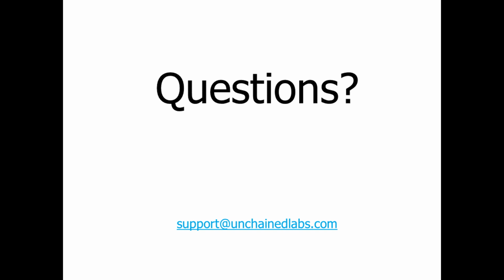If you have LEA Benchtop, I see another question coming in about that. If you have LEA Benchtop, you're fine already because that's already been captured as part of your setup. So it's compatible with LEA Benchtop. You pick the server through the RAS server that you already have established in your lab. If you're generally working with multiple systems and designing workflows at your bench or your desk, you're ready or set up to handle all of that.